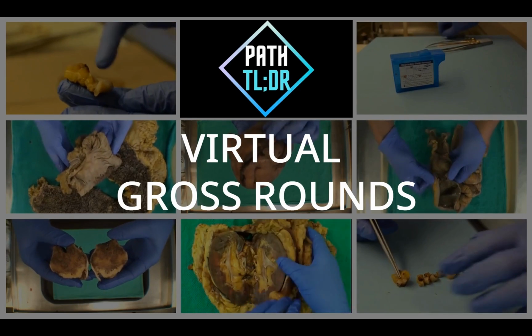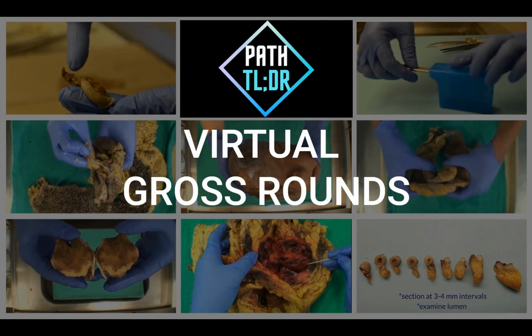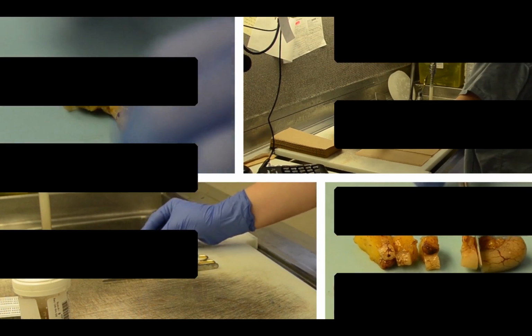Today, we're going to discuss placenta accreta syndromes, the so-called invasive placentas. We will discuss the staging, grossing, and overall features of this interesting pathology of both the placenta and uterine corpus. Sit back and let's get started.